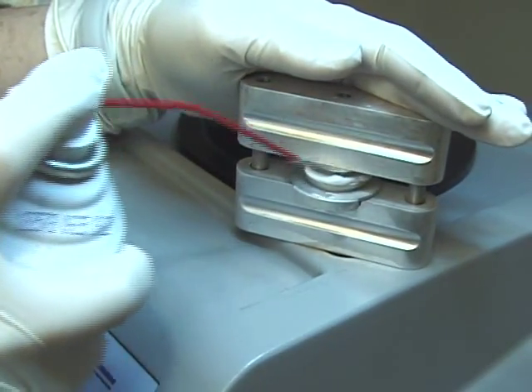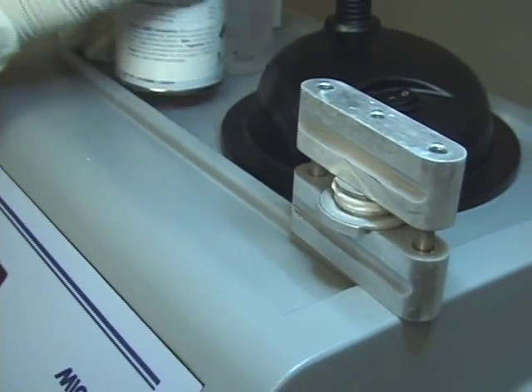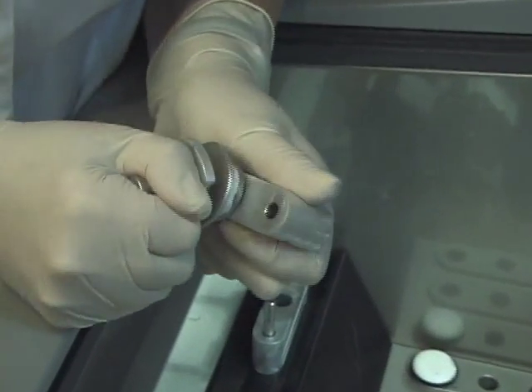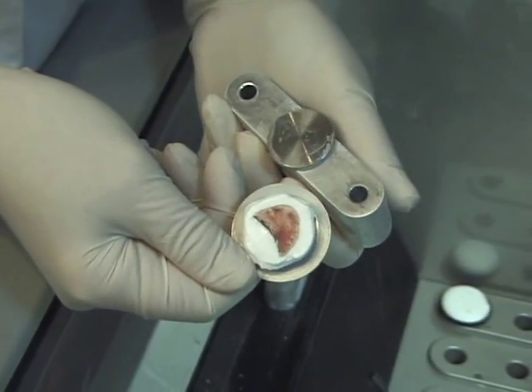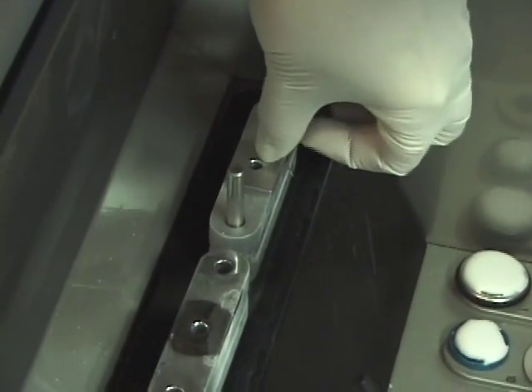This system is economical — there are no accessories that need replenishing or disposable parts to wastefully throw away. Last is the IEC adapter, which is used for both the IEC and the Tissue Tech chucks.